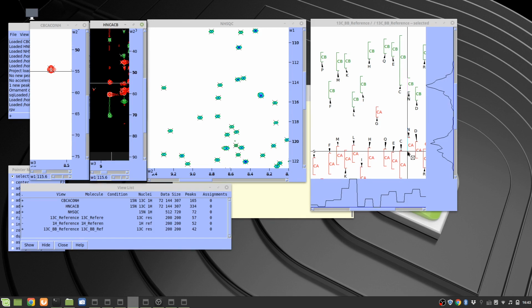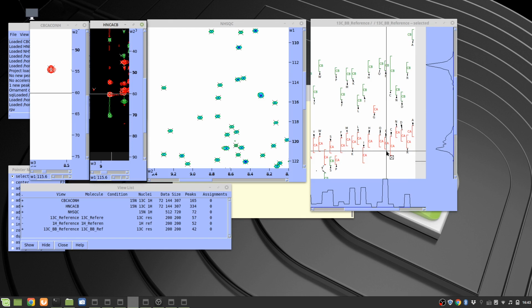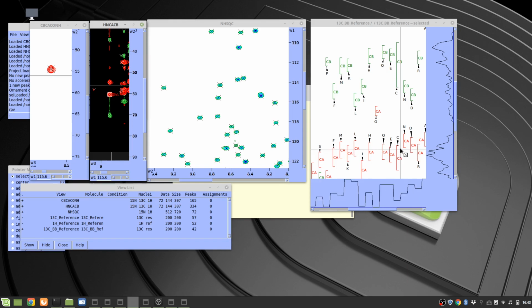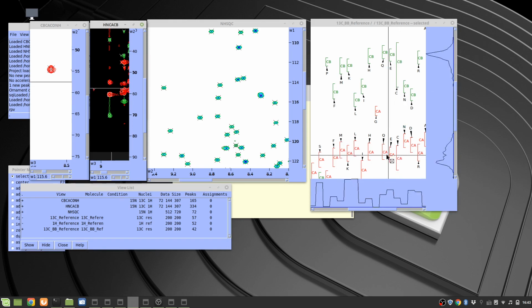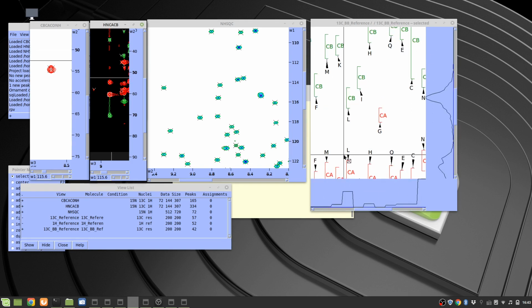So you have to be sure that your chemical shift can be either this or that, not really following the statistical average and deviation, because they are not of Gaussian shape. So you always have to be cautious in determining your amino acid type.